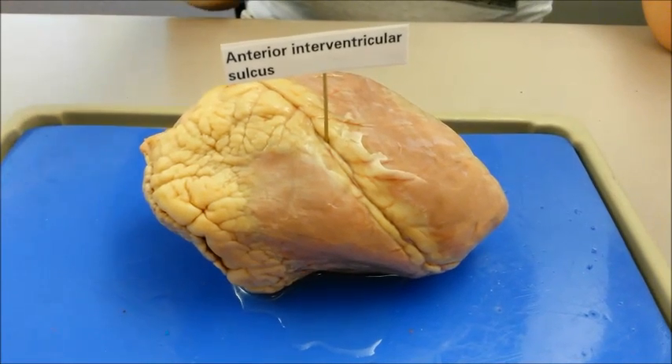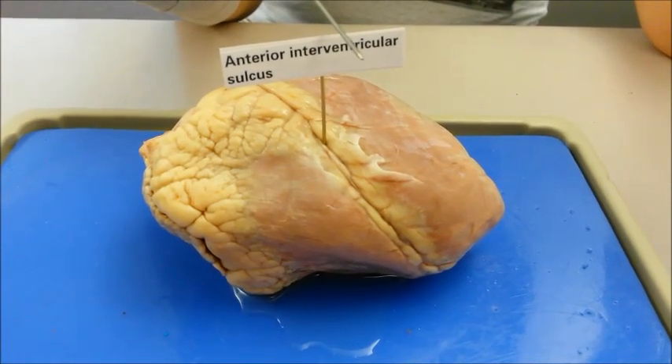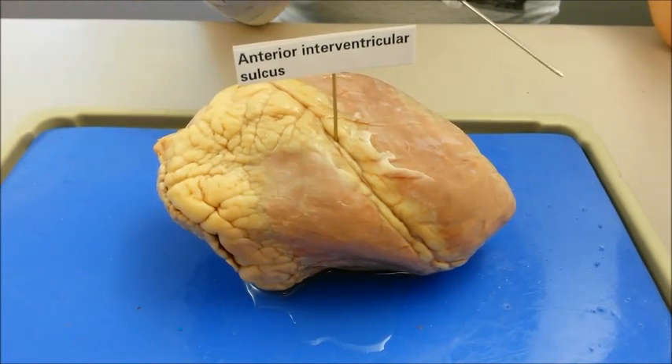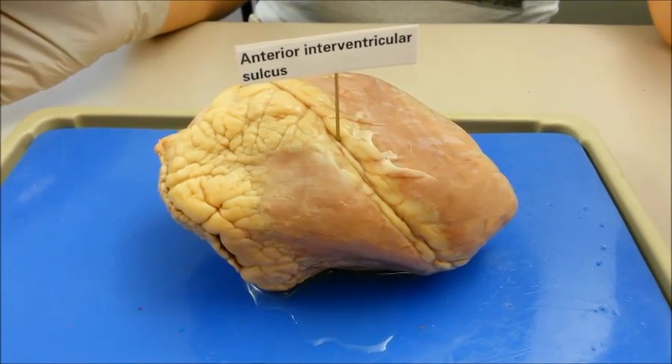The anterior interventricular sulcus divides the left and right ventricles. It is a groove that helps to identify where the interventricular septum is located between the two ventricles.